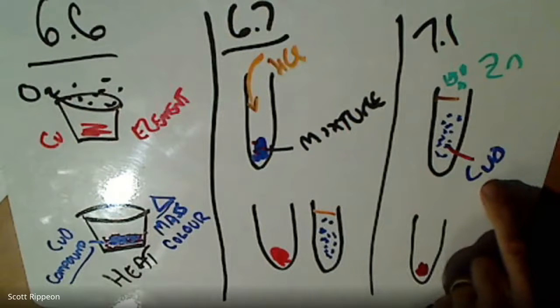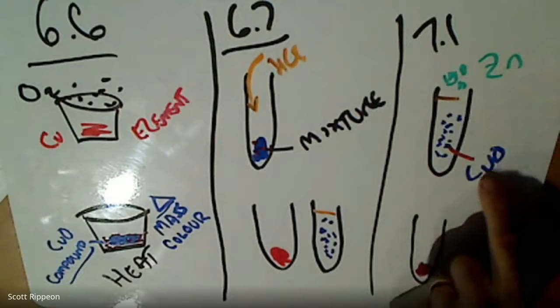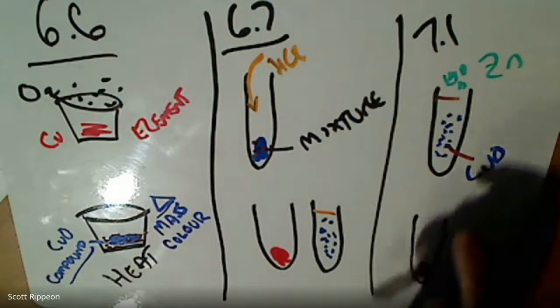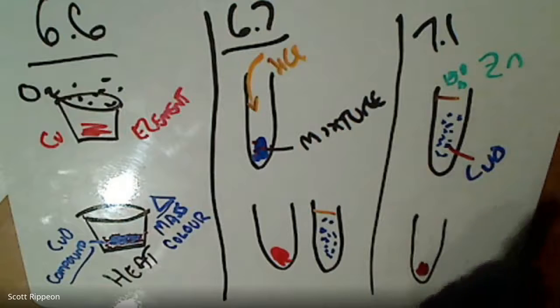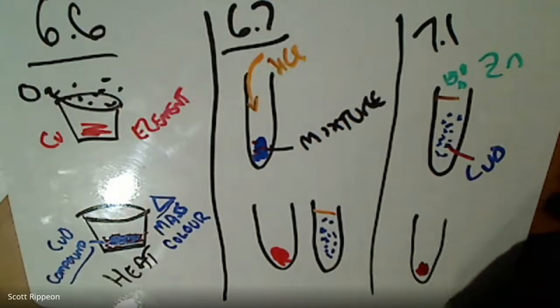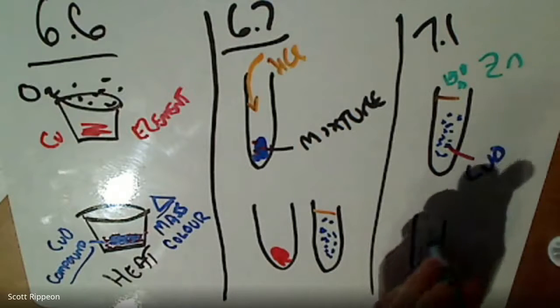They'd made a couple. The zinc comes in and takes the oxygen away from the copper and leaves the copper alone. So zinc came in, tore that copper oxide apart, and we ended up with the zinc, instead of being a solid, up here in solution.